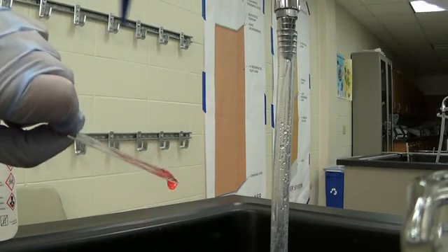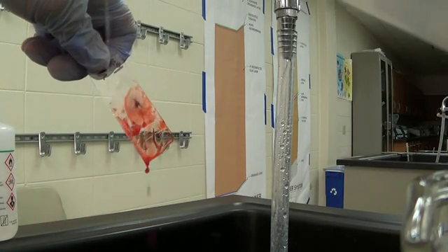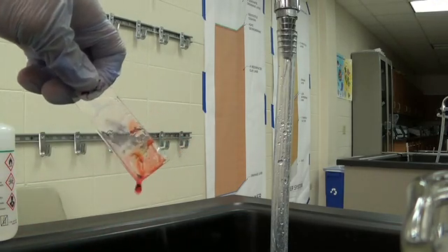Put the slide under the microscope and look for your bugs. Go all the way up to the high oil, 100x objective with oil immersion, and we will see what I have.